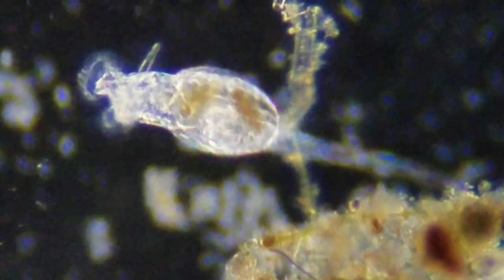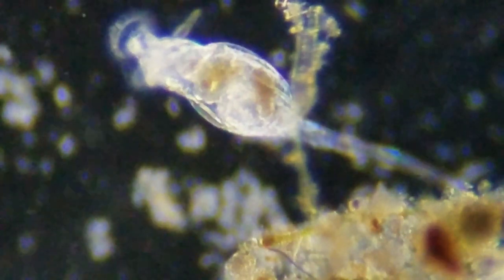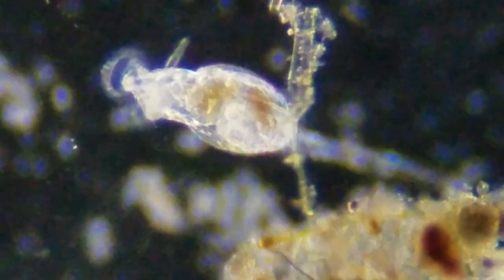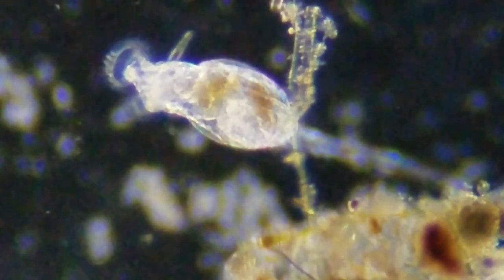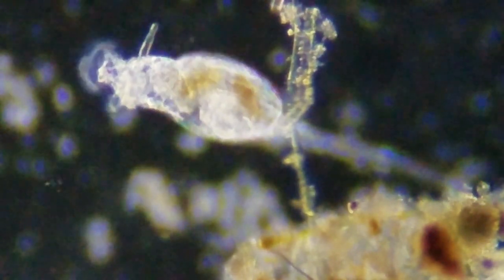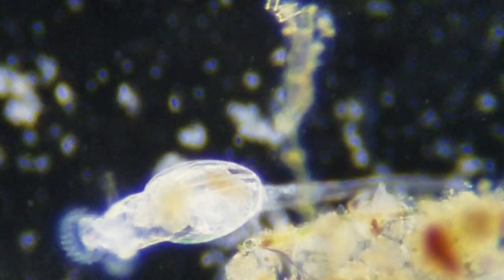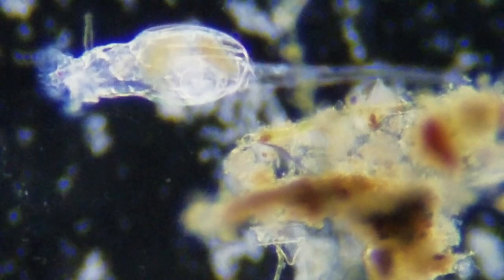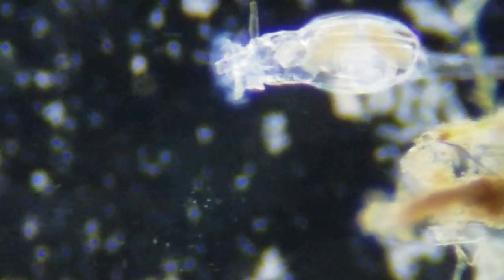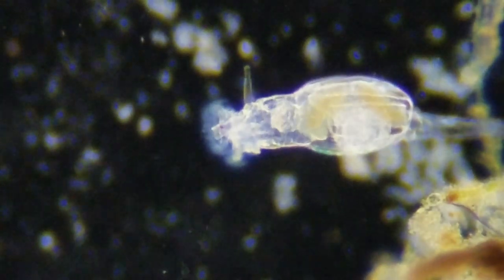Now what he's attached to — his tail can attach to things too. So his tail is attached to this algae. And if you look inside his body here you'll see that's algae inside his body, that particular color. These are pretty amazing. They are generally — most rotifers are female and generally asexual. It's said that the male rotifers do not eat. In the micro world you find all kinds of things. They can live three or four days to a month, rotifers. So they're not like our friend the hydra.